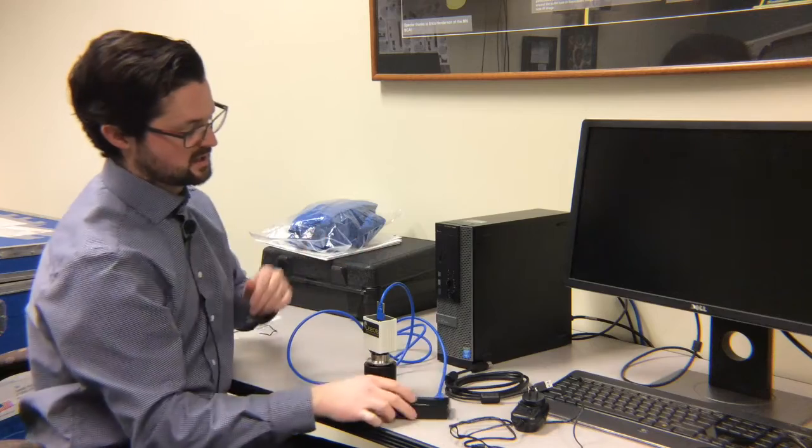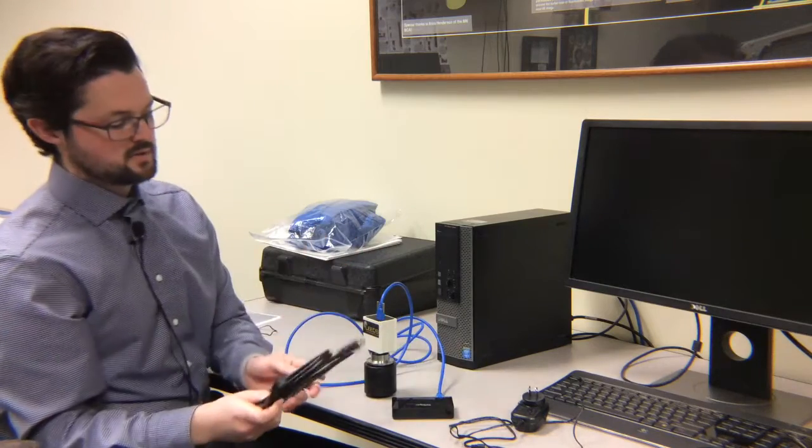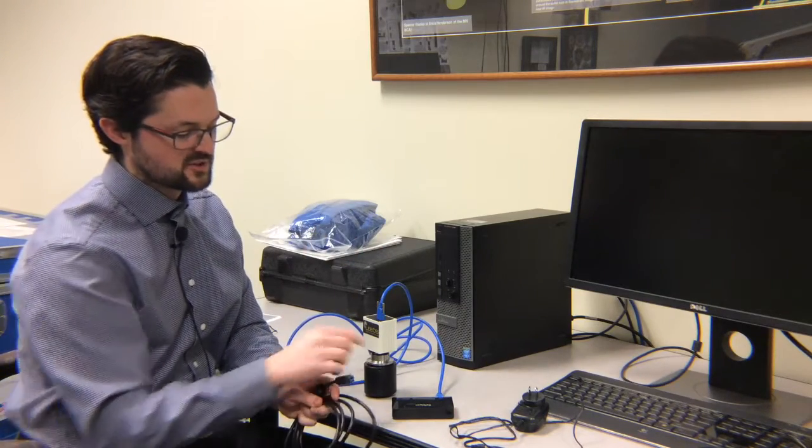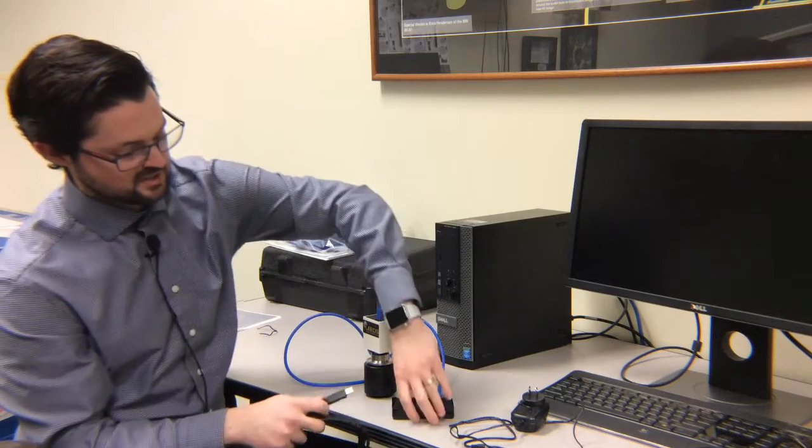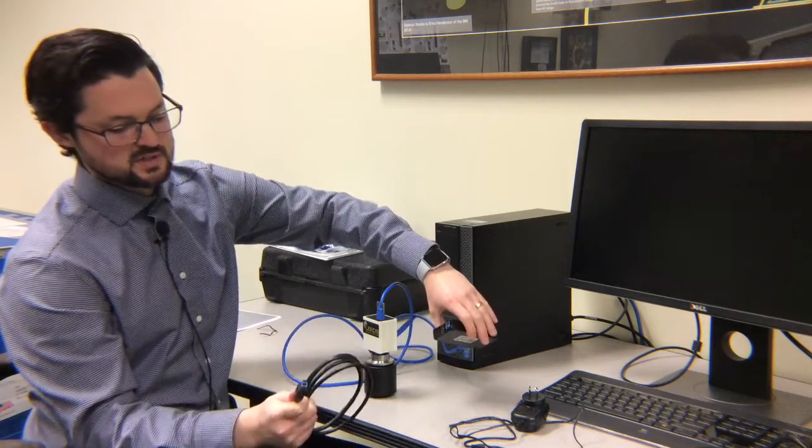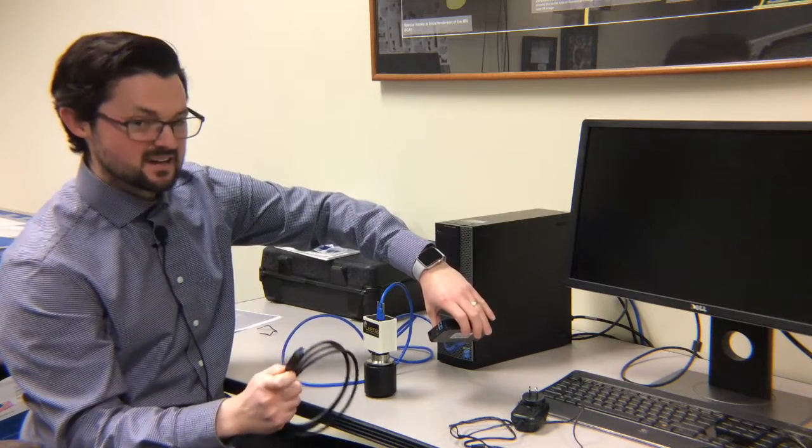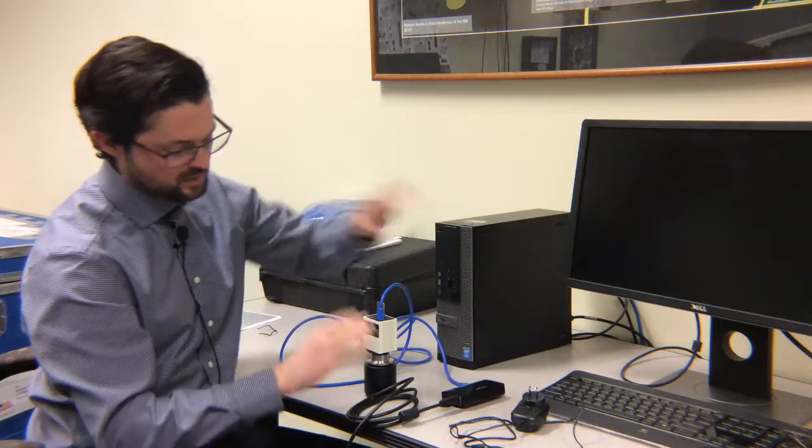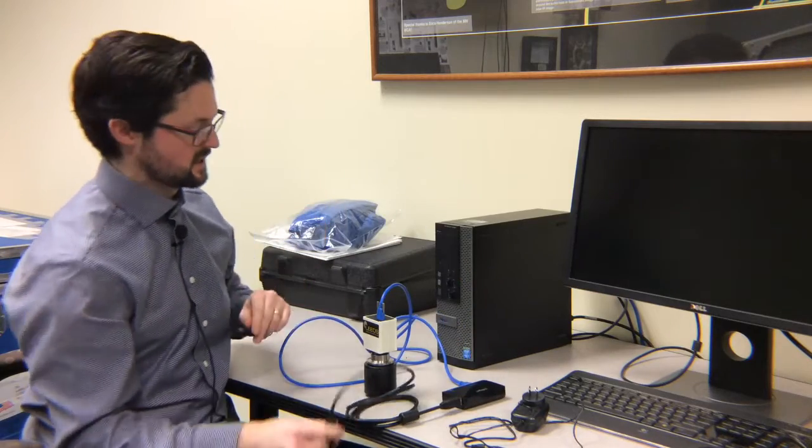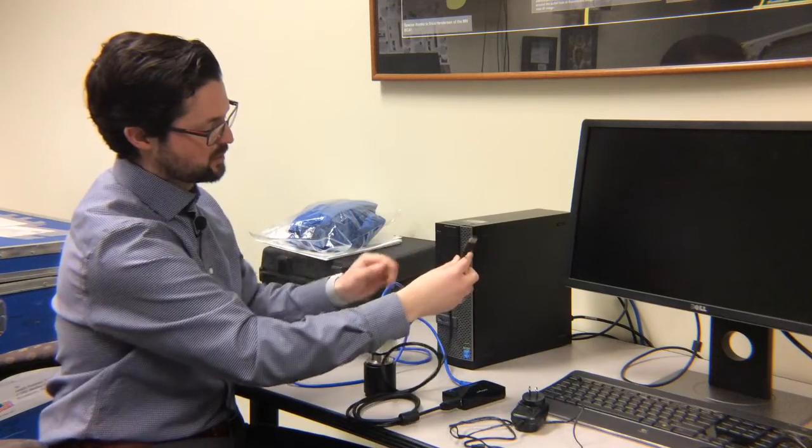Next thing we're going to do is plug the USB cable that came with the StarTech powered hub to your computer. You'll notice there's a USB, this is what's called USB-B, I believe, and that connects directly to the only part you can plug it into on the StarTech hub. This part of the cable you plug into your computer.